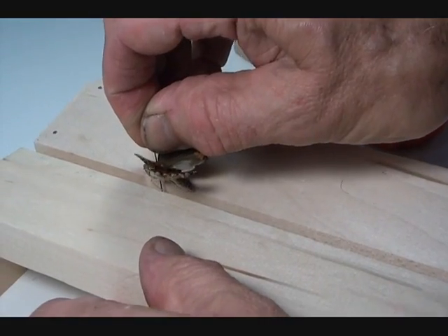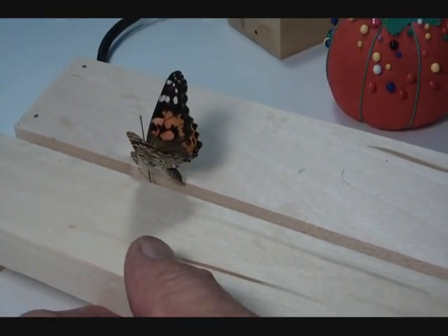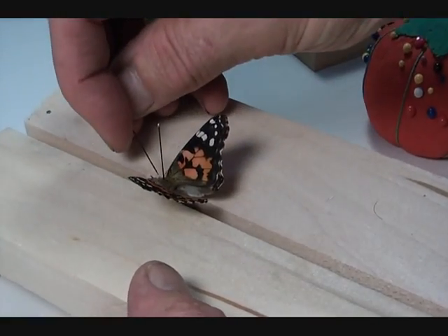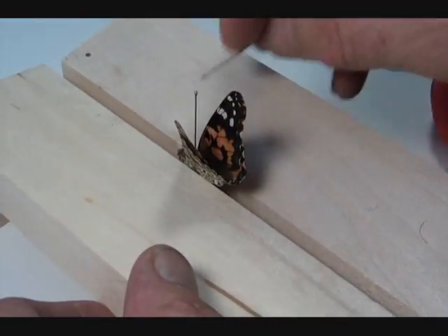Get the pin firmly into the cork at the bottom — actually it's balsa — and push the body down until the wings when they come down are resting right on the spreading board.